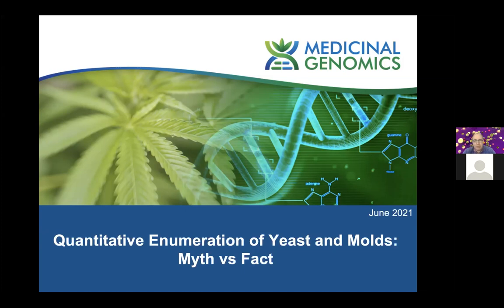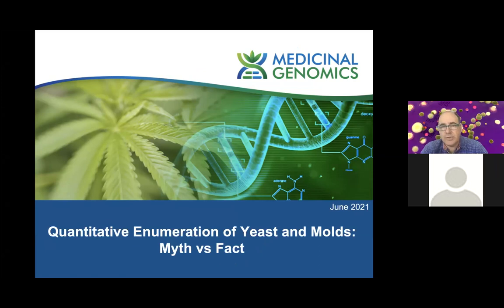I think there are some other conflicts that are worth also putting on the table. There are certainly many different business interests in testing cannabis. We have many of the growers who are very interested in getting reproducible testing from labs, and they want there to be a fairly open and free market there so they can trust any lab and get the same answer. There's also been concern that lab shopping can influence the marketplace, and that growers may be interested perhaps in lower fail rates so they can get more volume through, and sometimes those financial interests may not always be in line with the patient interests.